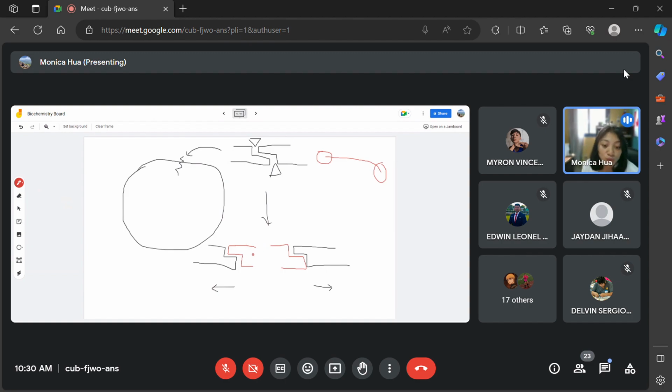So we need to create the DNA base pairs that align with this restriction enzyme site. Basically, we need to insert the same restriction enzyme site at both ends of our sequence. To do that we would use PCR, primer design and PCR. It's quite easy.